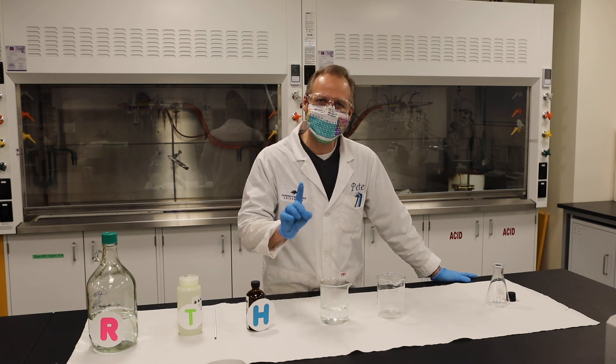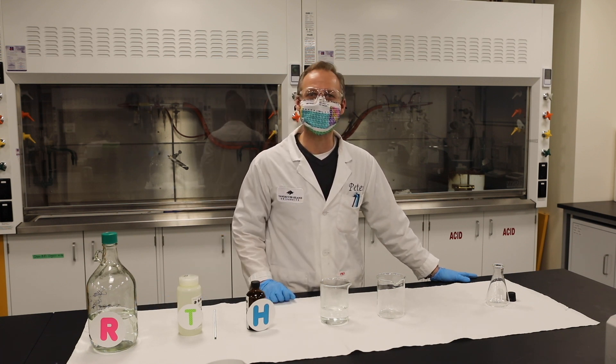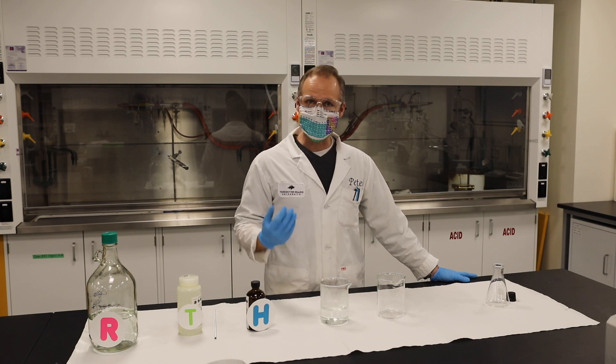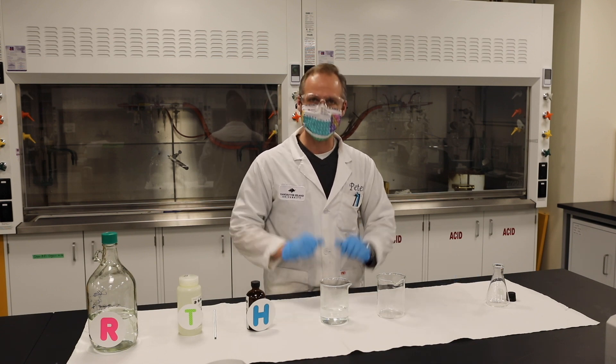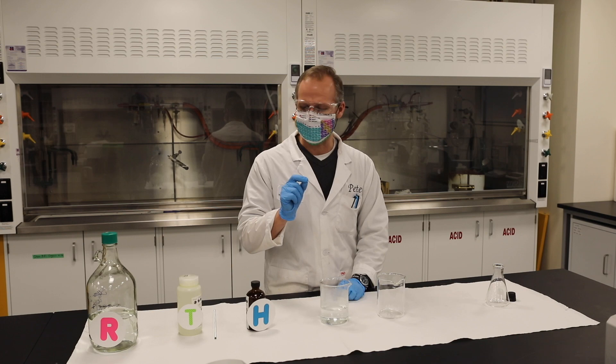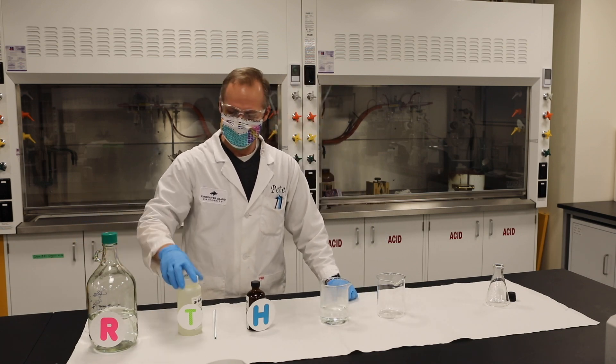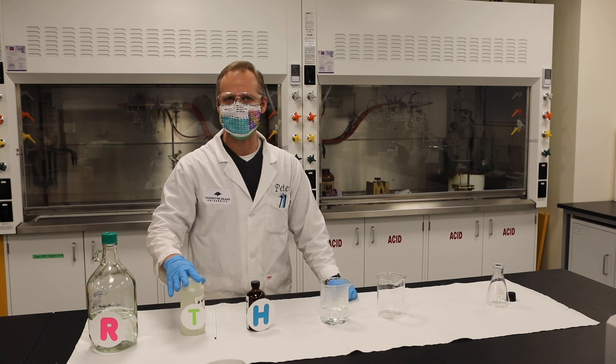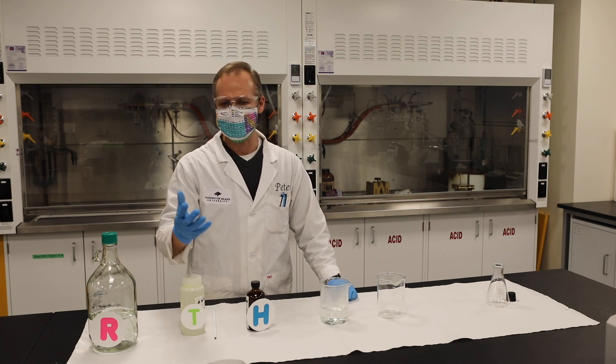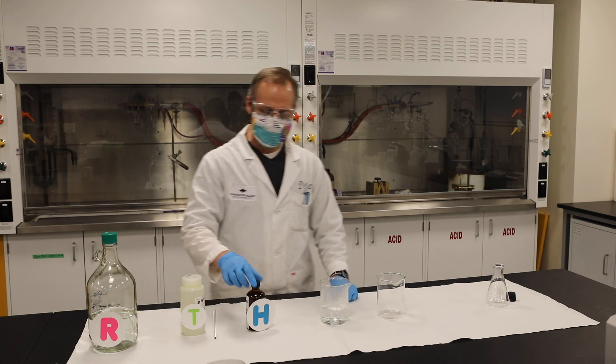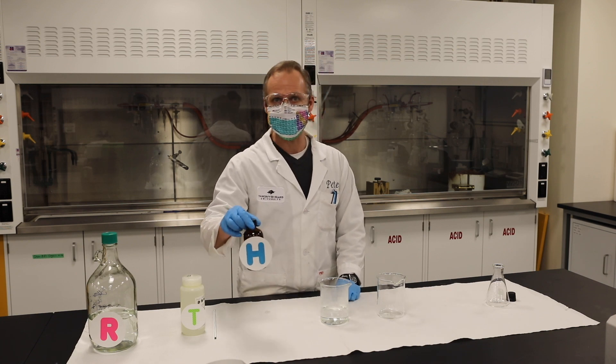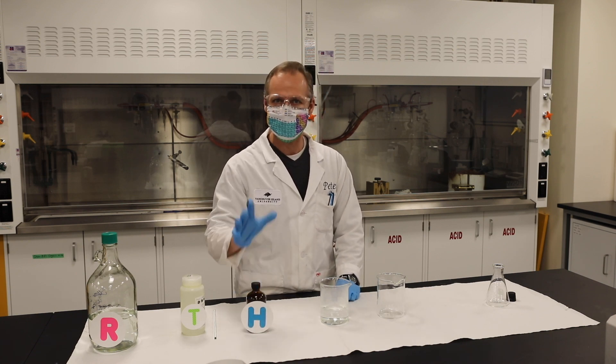Alright, welcome back. So for the final demo, what we're going to do is something called the traffic light reaction. It's a color reaction. All it is is just liquids mixing back and forth, but there's something special about them. I got sugar water over here. So water and sugar, nothing exciting, and I've got base, sodium hydroxide, a little bit like drain cleaner or something. And then in here I've got a dye, indigo carmine. It's a blue dye, same color as your jeans.